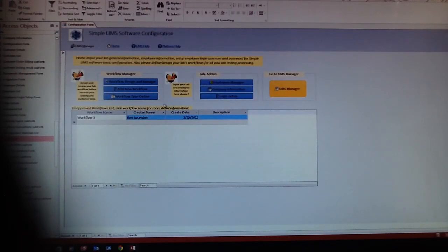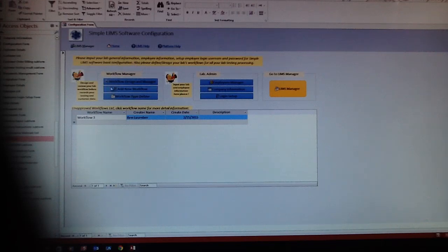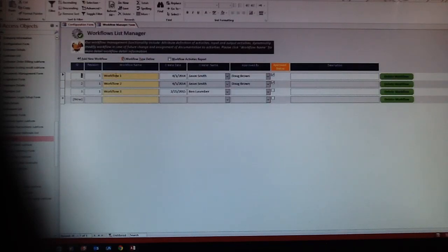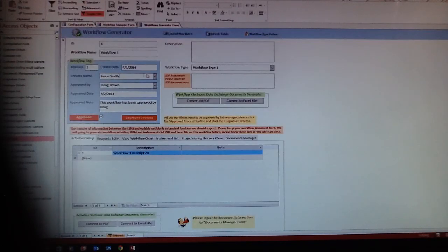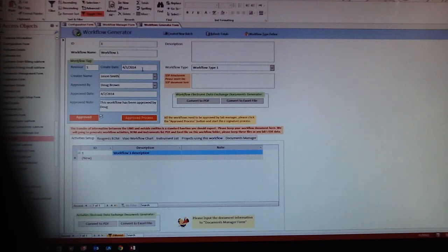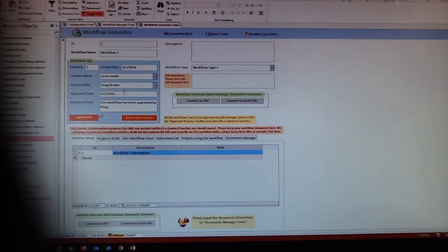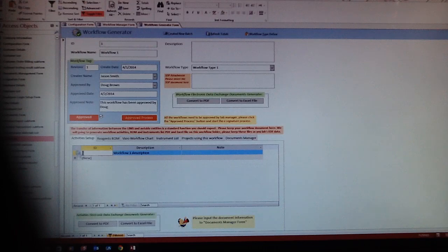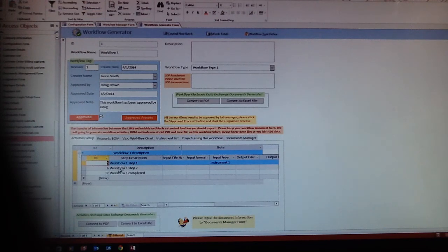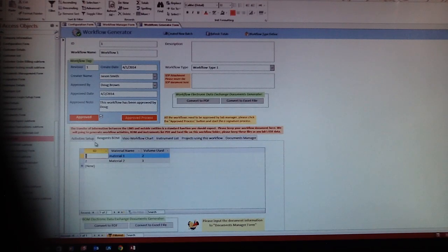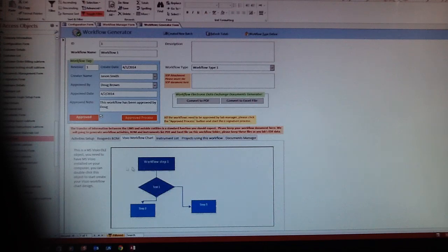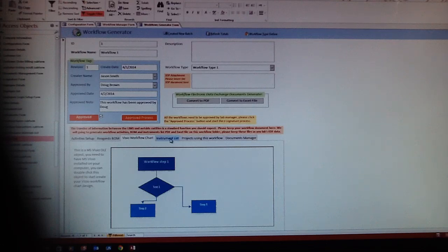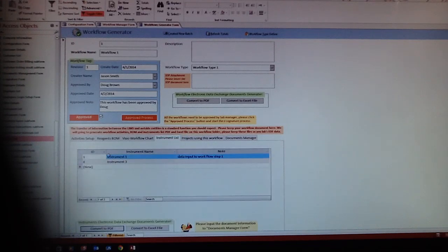The very important thing is the workflow setup definition. The workflow is how you proceed all those testings in your lab. Every lab has their own specialties, so you can define your workflows right here: workflow names, who created workflows, what are the activity steps on the workflow. You can say step one, step two, step whatever, and what kind of materials involving workflows. Here is the workflow charts that you can directly input from Microsoft Visio, and the instruments involved with the workflow.